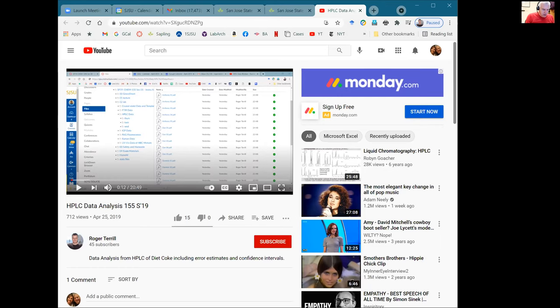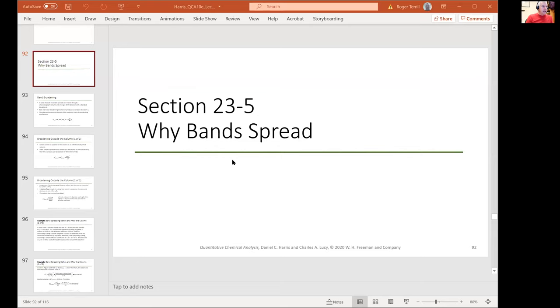Okay. So now PowerPoint, back to PowerPoint. Let's converse about why bands spread. So in this case, what we mean by band, let me put this as a question. What do we mean by band? Casey.